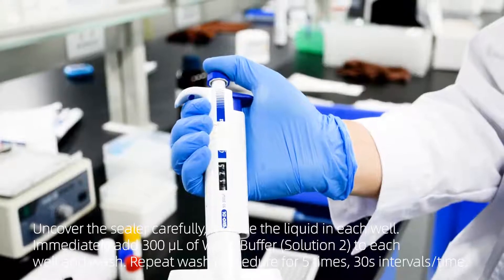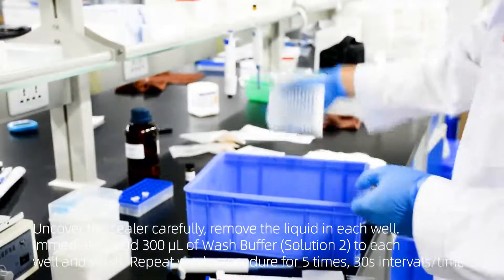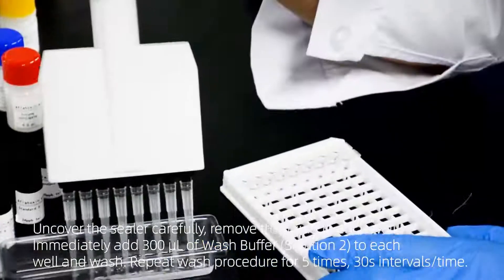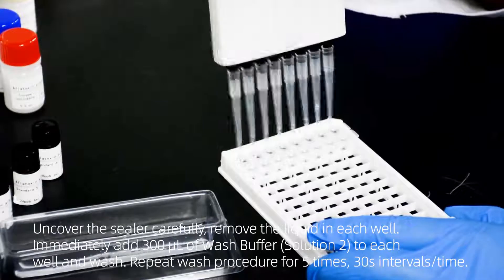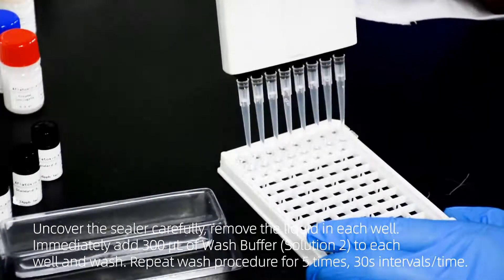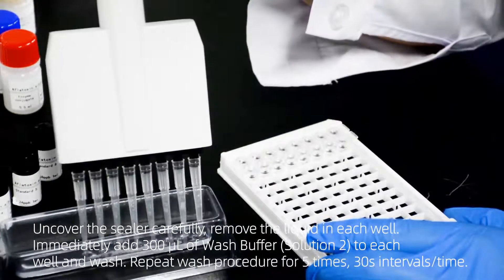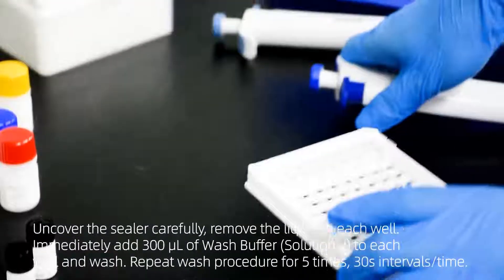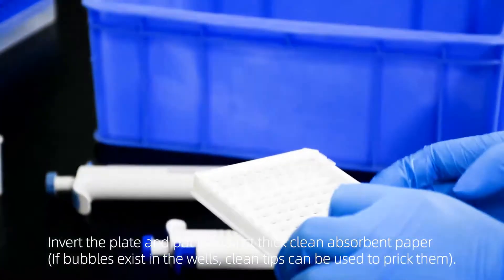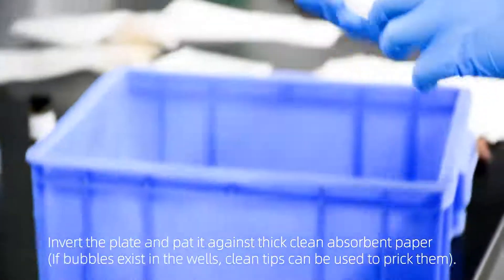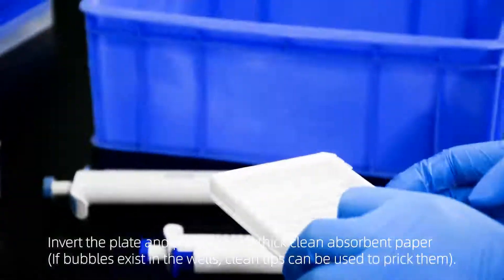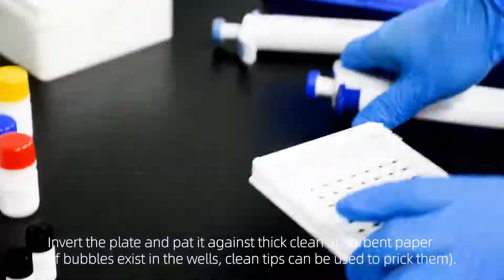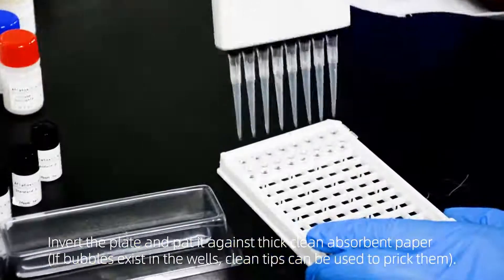Remove the sealer carefully and discard the liquid in each well. Immediately add 300 microliters of wash buffer solution to each well. Repeat wash procedure for 5 times with 30 seconds intervals. Invert the plate and pat it against thick clean absorbent paper. If bubbles exist in the wells, clean tips can be used to prick them.